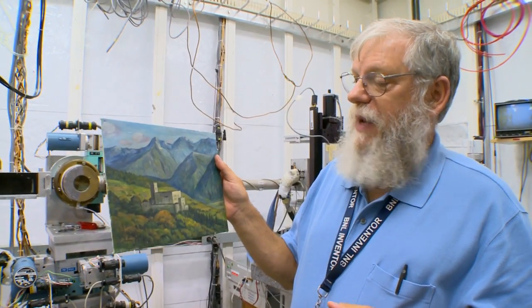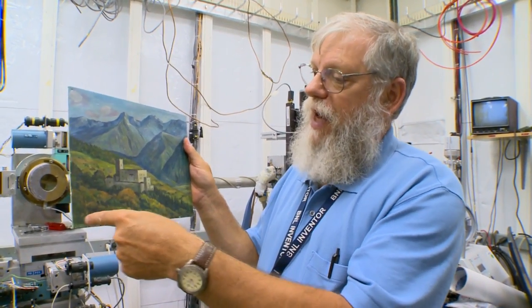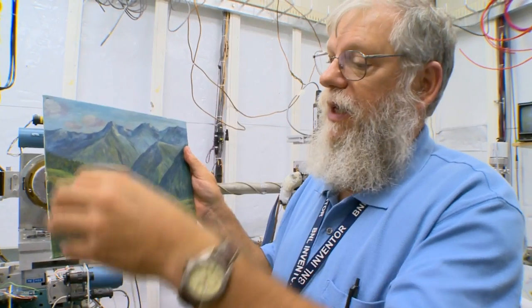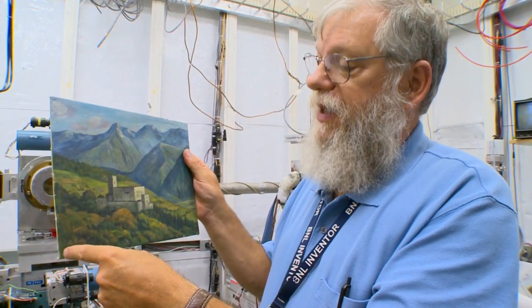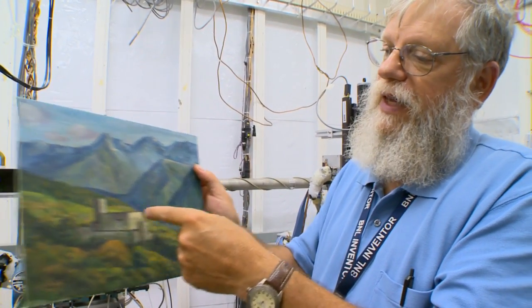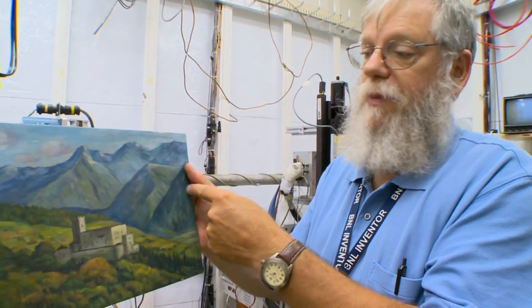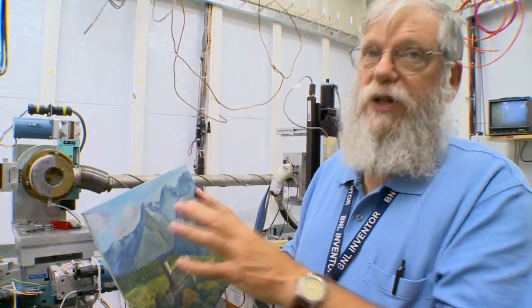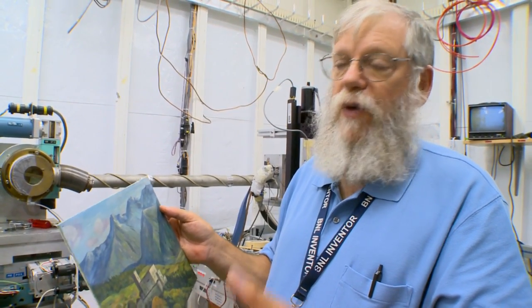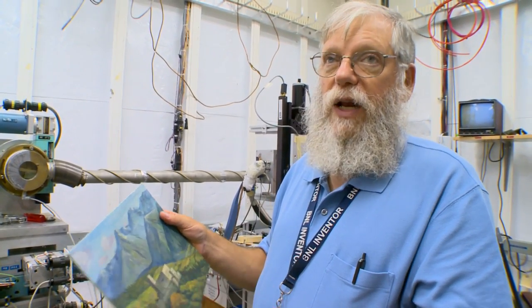So the way this thing works is we make a very small X-ray beam, 1/10 of a millimeter square in this case, and we put the picture in that beam, and we look at the X-rays that are stimulated by the synchrotron beam with our fancy detector. And then we move the picture through that spot in a raster fashion, so we gradually cover the entire picture with these 1/10 of a millimeter square intensity maps. And then we can reconstruct that into the image of the picture based on what elements are in the paint. So we can see where is the iron in some kind of red paint, we can see where the copper is in some kind of green paint, and so on and so on. That lets us really reconstruct the picture.